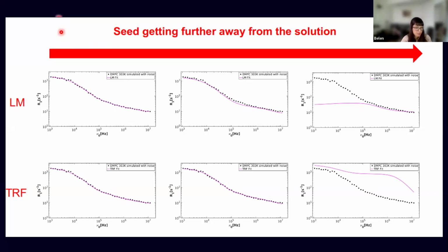or TRF. Here I am showing six of the simulated curves, and noise has been added to make them look like an experimental dispersion profile. Here's the key: if we know the generating parameters, we can really test the performance of each method and compare the solutions fairly.